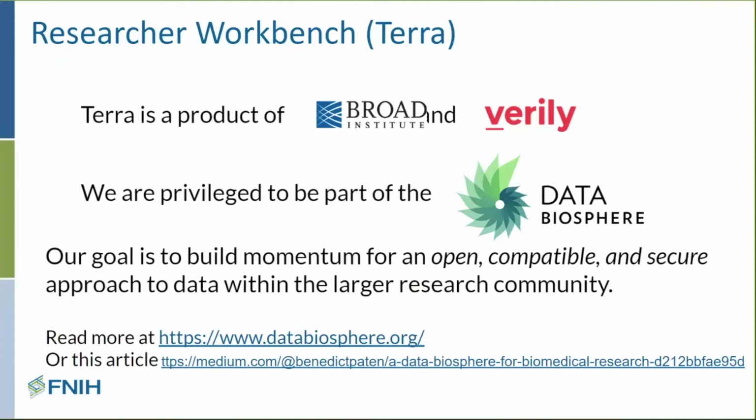But as FireCloud continued to evolve, it was pretty clear that what we were building wasn't actually specific to cancer research, but could be used more broadly for anything that involved genomics data, and actually anything that involved big data in Google buckets and BigQuery.